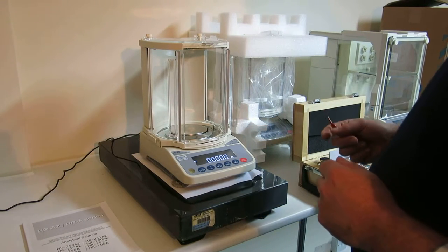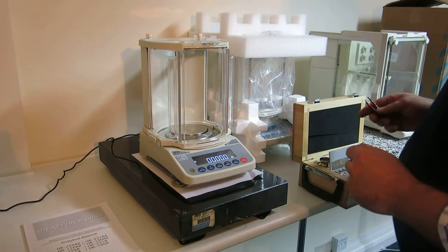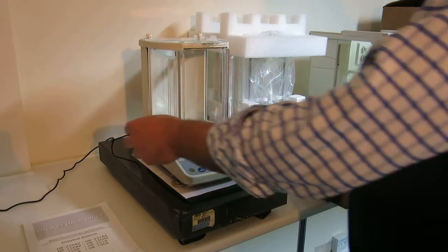252 grams, 0.1 of a milligram. It's rather a clever device this. They've thought about this, the manufacturer's A&D, a Japanese company.